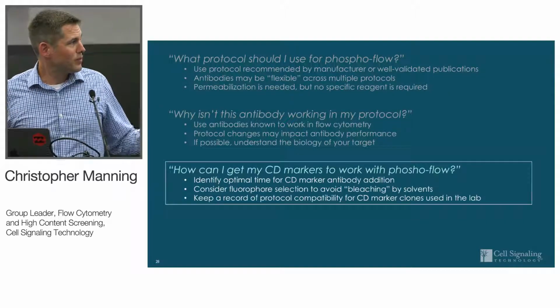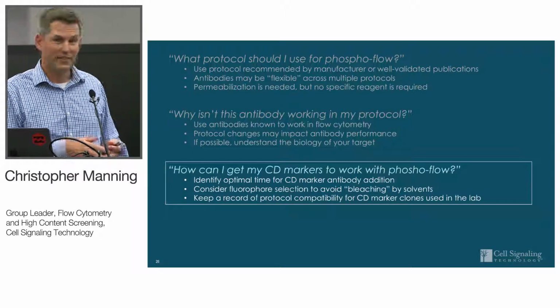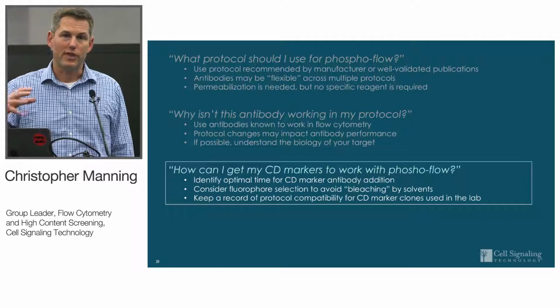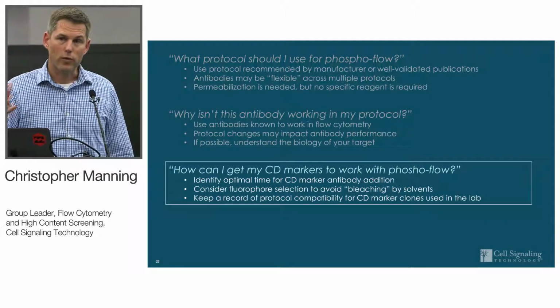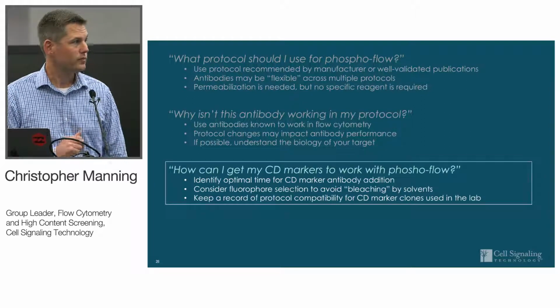So to summarize, you can do this. You can get phenotyping and phosphorylation in the same assay. It's just helpful for you to understand what's the optimal timing to use, and what fluorophores you should use to avoid any bleaching if you've got to use any harsh solvents.